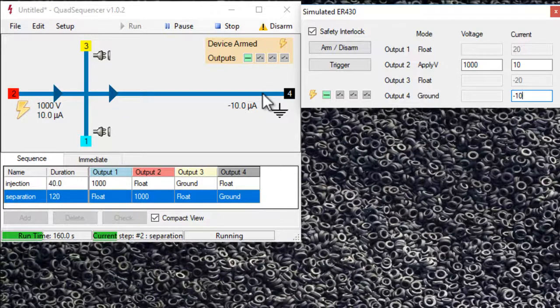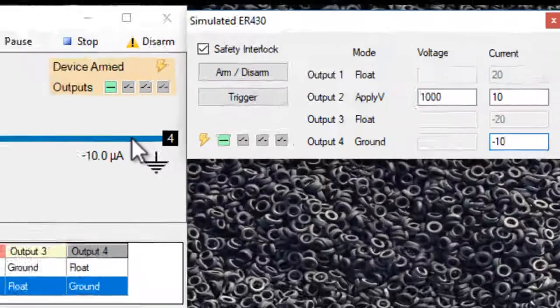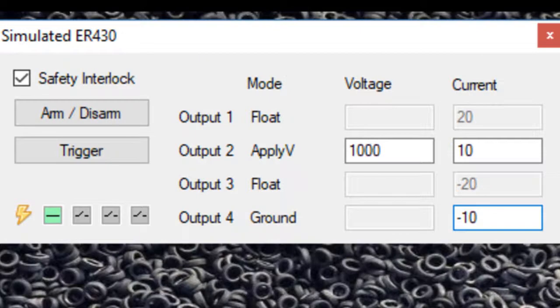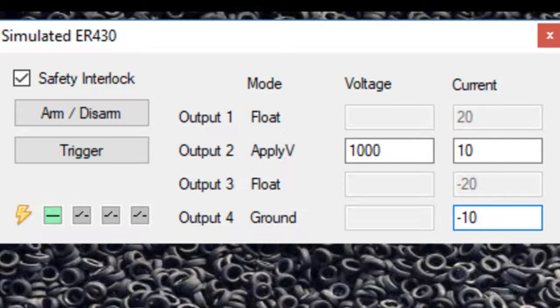So you can use the simulator to do tests or to be used in teaching without a high voltage sequencer connected to the computer.